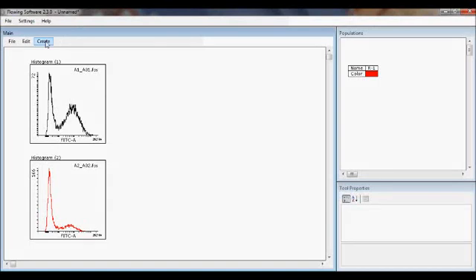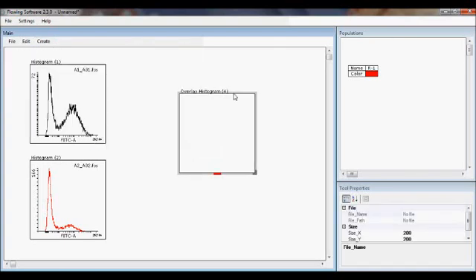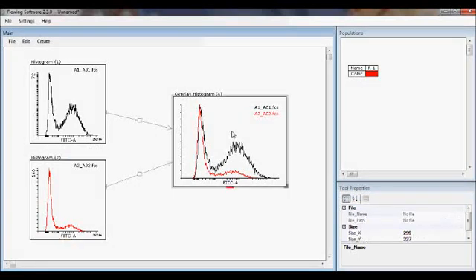Overlay histogram is one of the most efficient tools for visualizing differences of two samples. In Flowing software, you can create an overlay histogram, but you cannot load a data file directly to an overlay histogram. Instead, you combine different histograms. For instance, I have histogram 1 and 2 here, and when I combine these into an overlay histogram, the data can be seen directly here.